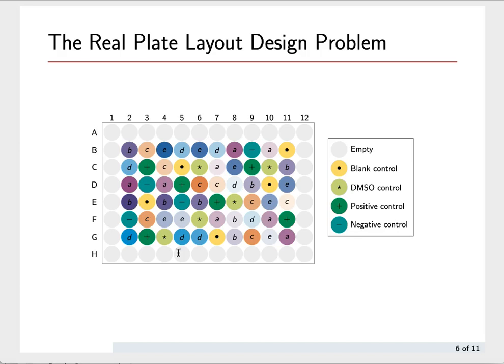On the other hand, if we have a robot which can actually do this, then we can take pictures and we can organize all of this by computer, and we can actually reduce the number of experiments that we need to do.